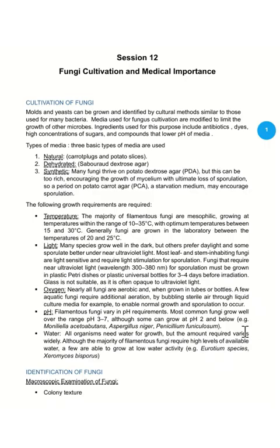They require more oxygen. So if you want to grow them in the lab, you need to provide an aeration system. Aeration system means adding more oxygen to the environment or the medium, and usually they grow in liquid medium. To add more oxygen by a certain type of equipment in the lab, you call it bubbling air, and this will provide more oxygen to the fungi to grow.